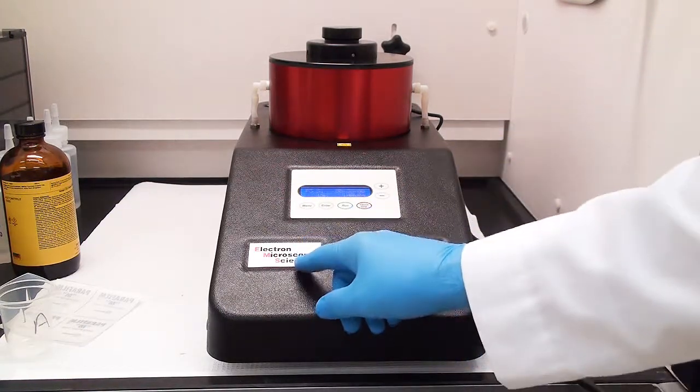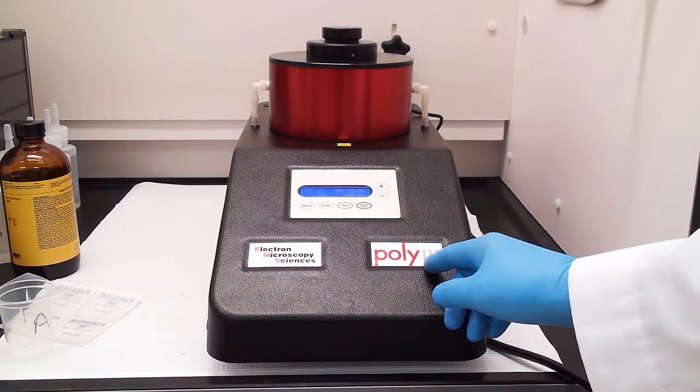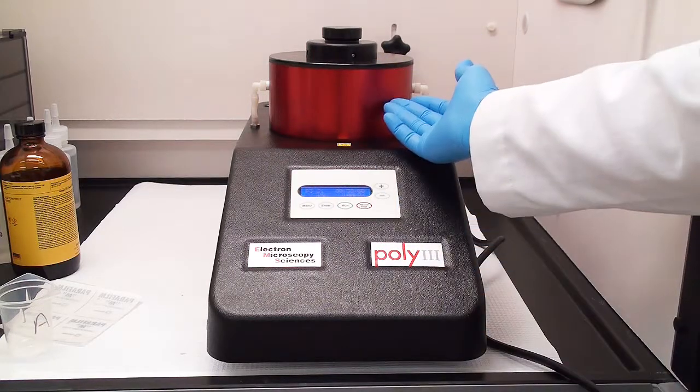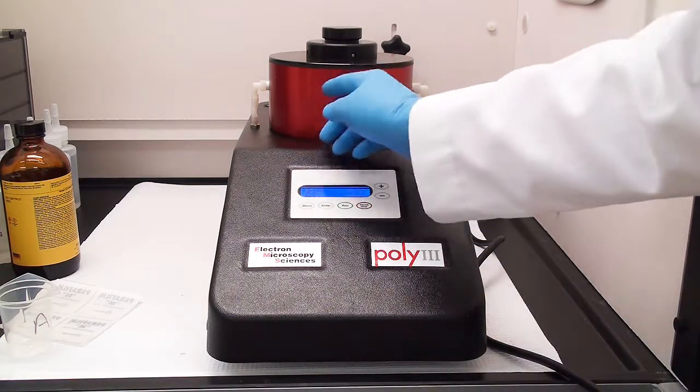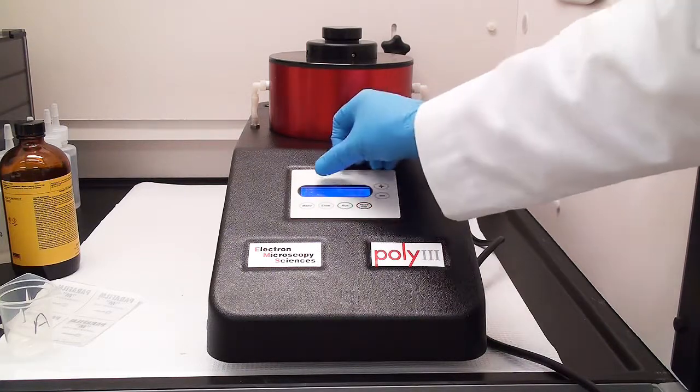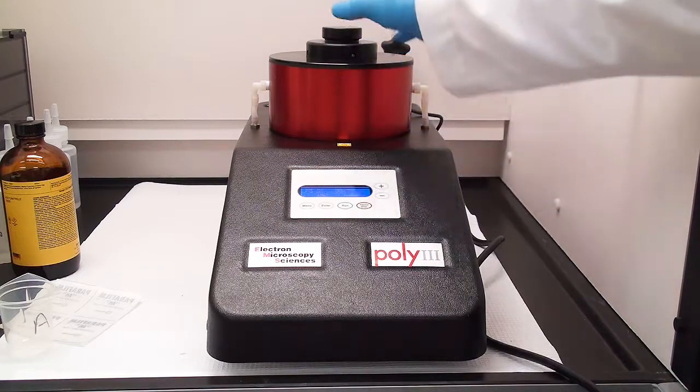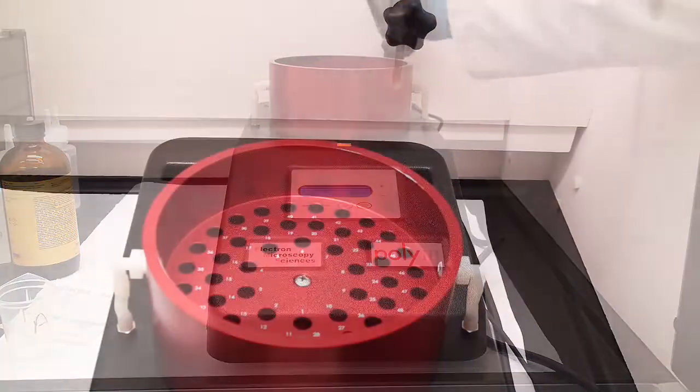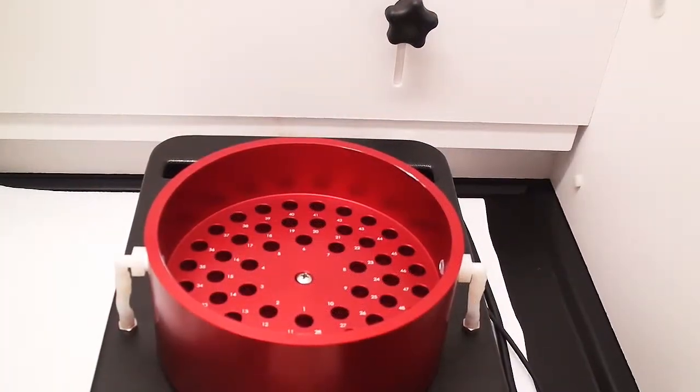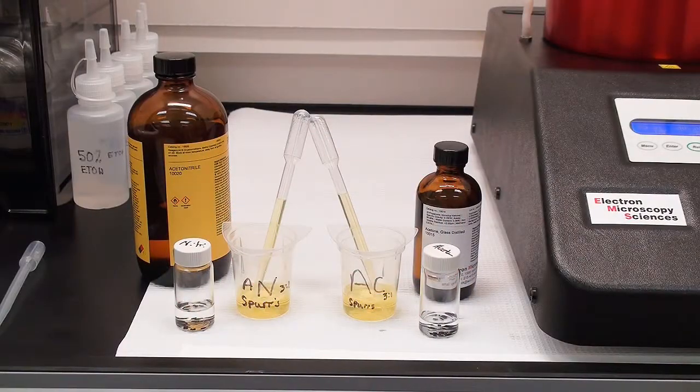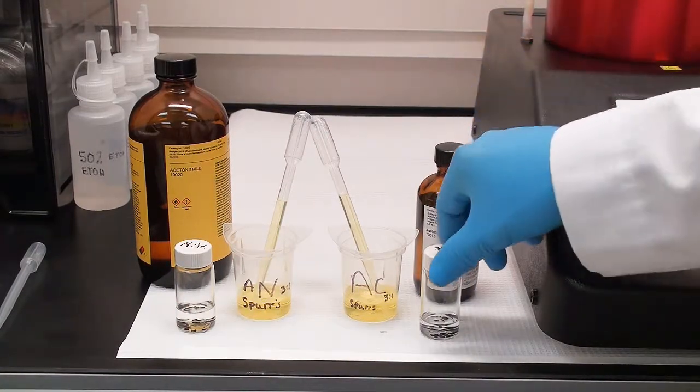The unit itself consists of a pump that will be pumping out the chamber. The chamber is heated or cooled depending on the dehydrants and is fully programmable and comes already loaded with programs that could be adjusted. Inside, we have the chamber, which can be heated and cooled depending on the different dehydrant that we're using.